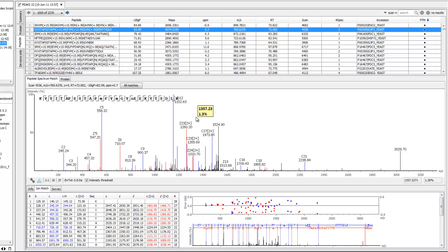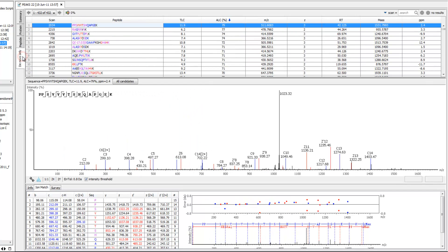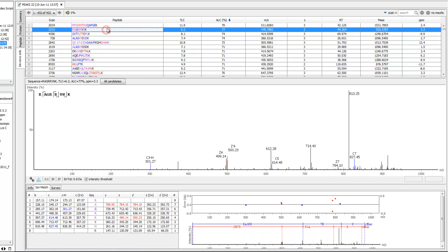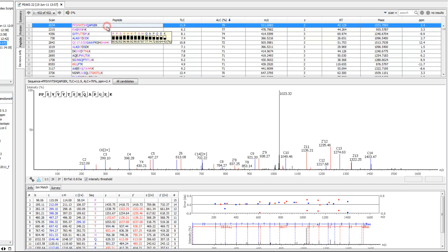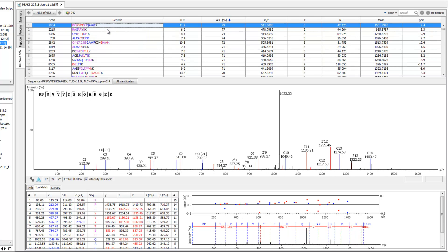The final tab, labeled de novo only, displays the results that are identified exclusively by de novo sequencing. Since these spectra do not match any significant peptide hits in the database, they are particularly interesting novel peptides that no other software can find.